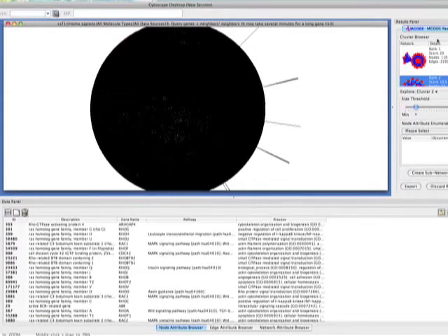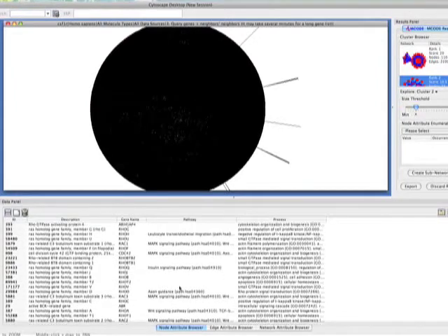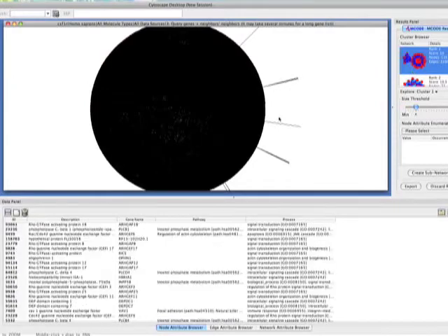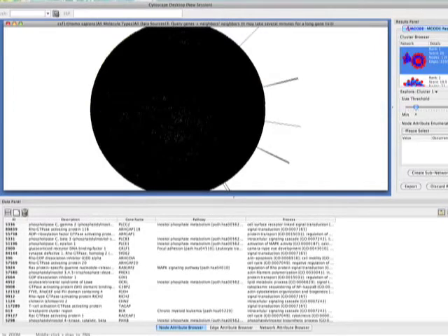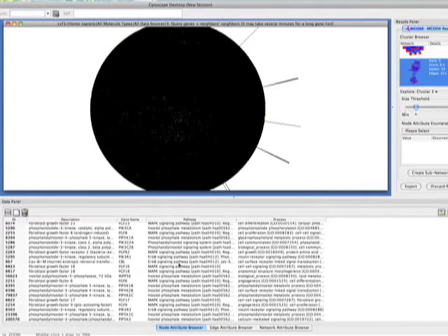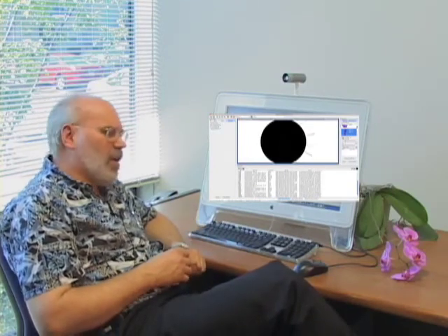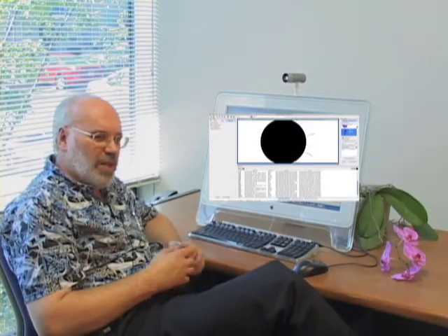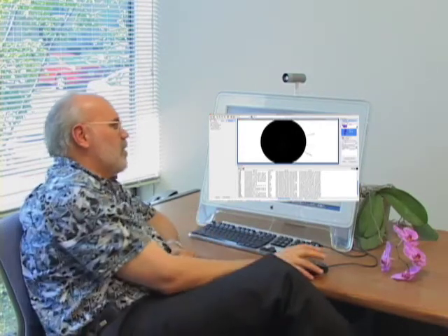And we can see this first subgraph that I highlighted involves RAS homologs, is involved in MAP kinase signaling and a variety of biological processes. We click a second subgraph here. We now see Rho-dependent signaling, and continuing down, we can again find here a group of MAP kinase and MAP kinase signaling pathways. And it's a kind of paradigm that a gene tends to do what the molecules it interacts with do. There are 20,000 genes in the human genome, and many of them have not been annotated. And so this inference about function through what interacting partners do is a very useful paradigm.